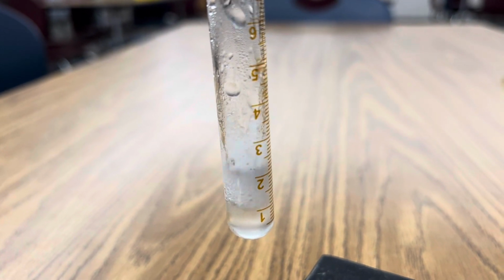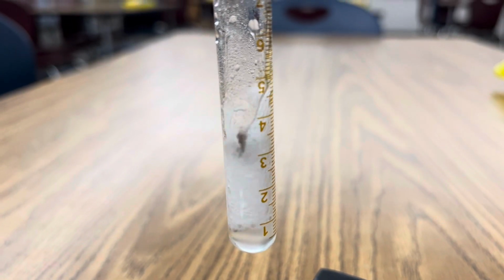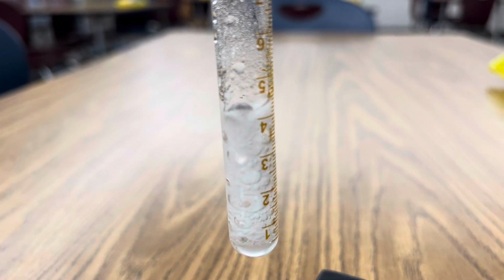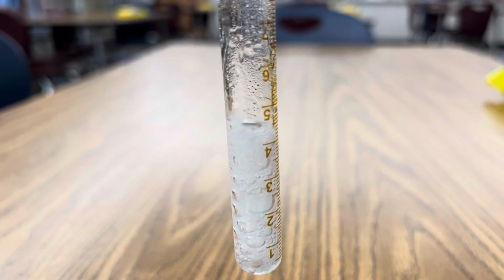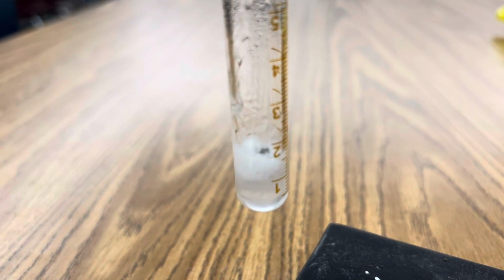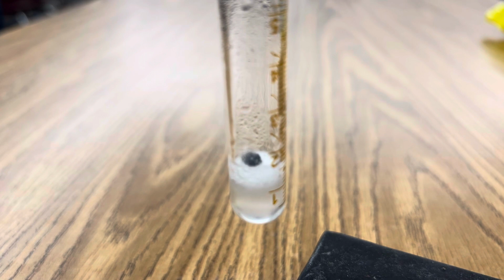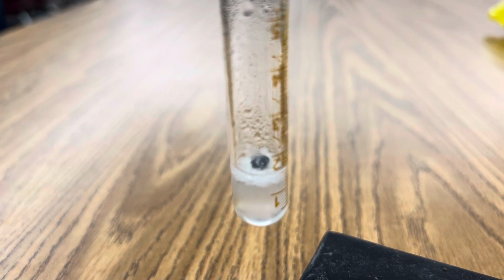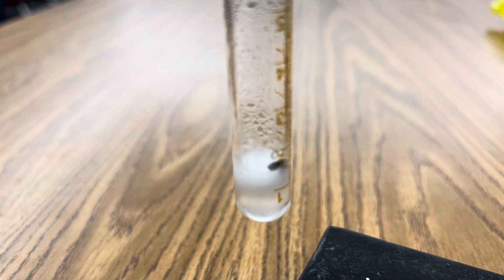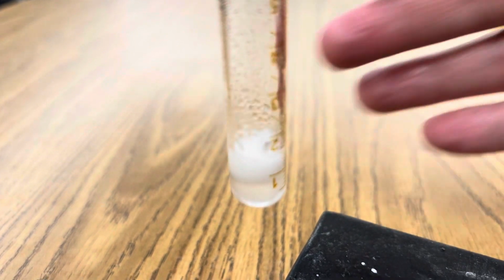You see that lithium just bouncing on the surface of the hydrochloric acid. And you can touch the test tube and it feels very, very hot to the touch. Very exothermic.